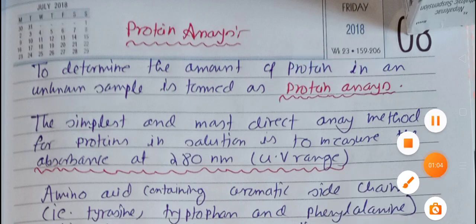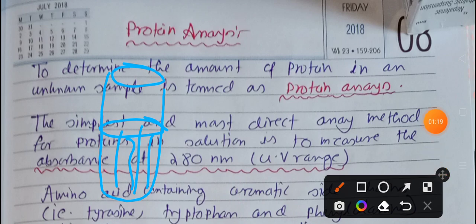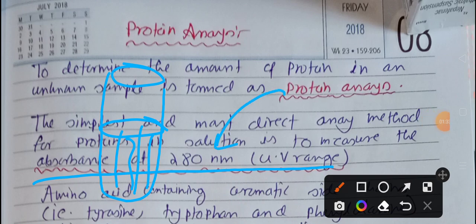Okay, so suppose you have a solution and you want to measure the amount of protein in that solution. If you ask me, I will suggest the simplest type of method. I will suggest you go and use spectroscopy to measure the absorbance at 280 nanometer. Okay, then you will ask me why at 280 nanometer.